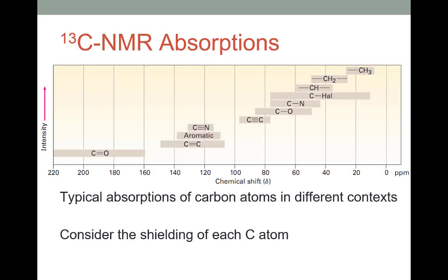Well, when we get a readout from a carbon NMR, we can identify what kinds of atoms there are and how the molecule is structured, based on charts kind of like this. Every textbook will have its own chart. We're going to see a more detailed version, but just by way of generalities, we see typical alkane stuff showing up at the very low end.